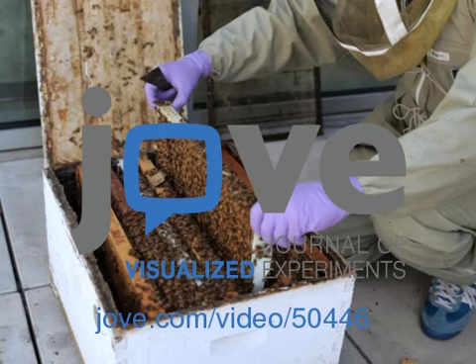To mount bees for the PER assay, chill the bees at 4 degrees Celsius until they are completely immobilized. Mount each bee vertically into a plastic tube specially designed for PER. Use tape to keep the abdomen inside the tube and keep the head sticking out of the tube. Put the tubes on a rack with 2 rows of small plastic columns. 1 row is numbered so the mounted bees can be assigned an ID number. Put the racks with the treated bees into an incubator at 34 degrees Celsius and 80% humidity for 2 hours.